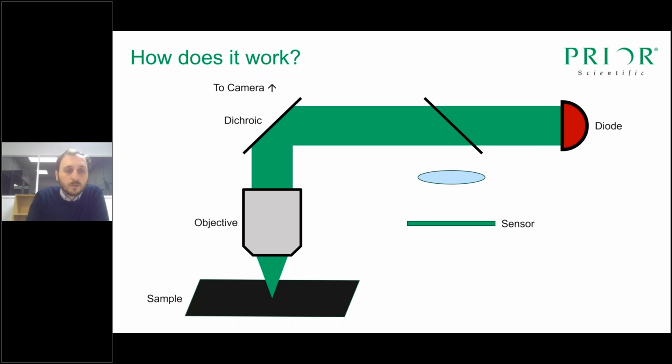So what the autofocus then has to do is contain a sensor that light can then be refocused back onto. That's represented by the blue signal here. So for those of you familiar with industrial microscopy, this is very, very similar to, I would say, reflected bright field imaging, for example.